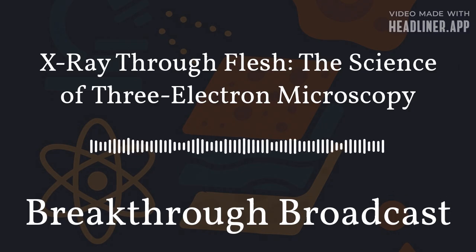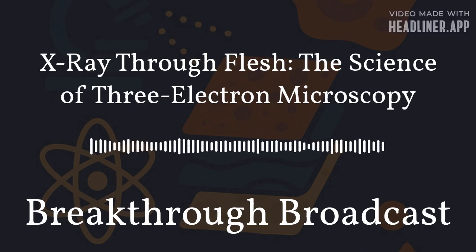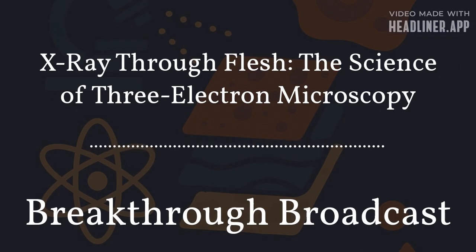What changed everything was the shift to digital imaging and advanced computation. Digital detectors allowed scientists to capture electron signals with extraordinary precision, and powerful processors made it possible to reconstruct complex structures in ways that were previously impossible. These advancements laid the foundation for multi-signal imaging, where different electron interactions were collected and combined. Three-electron microscopy grew out of that evolution. Instead of relying on one incomplete signal, it brought together multiple electron behaviors to produce an image that was richer, clearer, and far more accurate than anything before it.